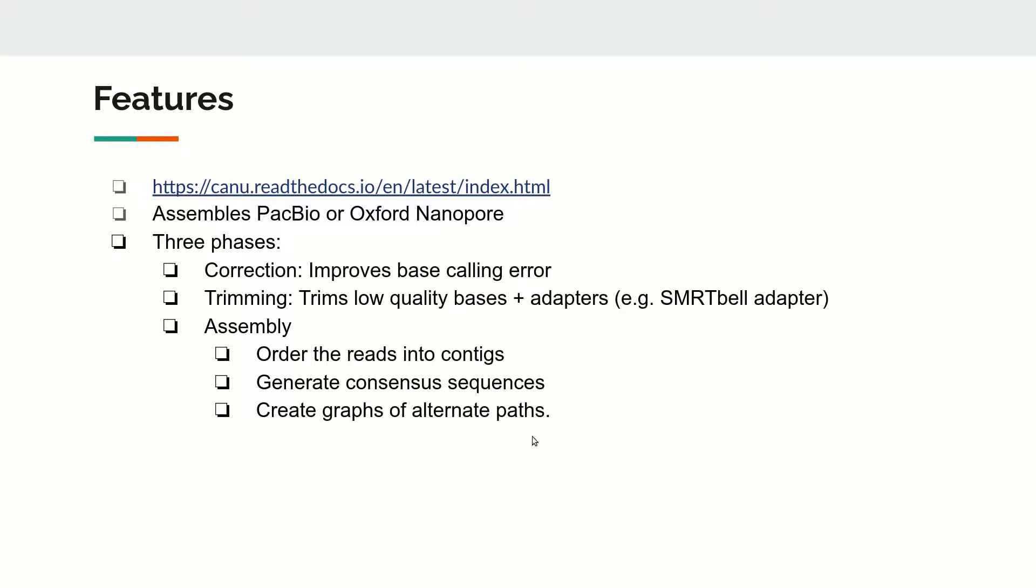In summary, Canu does everything from start to end - error correction, trimming, and assembly - all in one single package. The only limitation is that it is computationally much more time-intensive. For this demo data, it took almost one and a half to two hours to complete the assembly process.